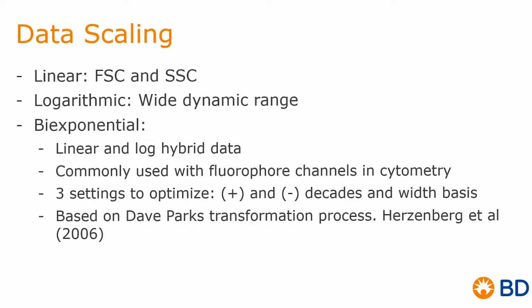And what do I mean with data scaling? Well, we have different scales. Linear, which is mostly used for your FSC and your SSC parameter, which are used generally for size and for complexity respectively. We also have logarithmic, which covers a wide dynamic range, and these are mostly used with all your fluorophore channels. However, what is ideally used in fluorophore channels and commonly used is the bi-exponential scale.